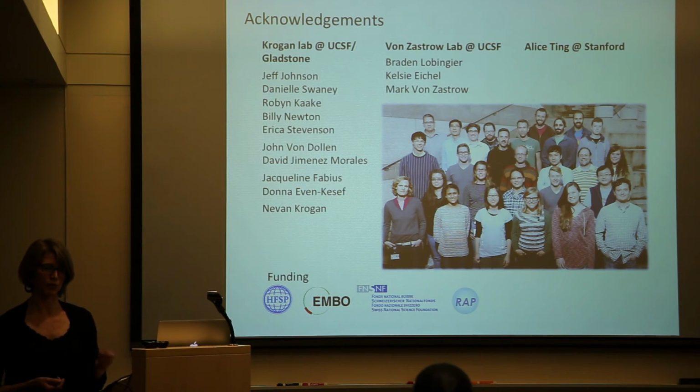So even if your protein is of low abundance, you get an intensity value, and this is a huge issue in discovery proteomics. So that is a big advantage. And for this reason also the label-free quantification, if you do it by targeted, is more accurate than if you do discovery proteomics.